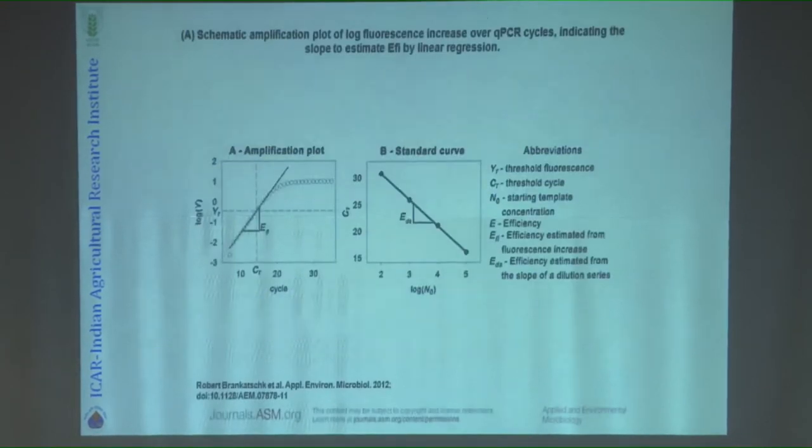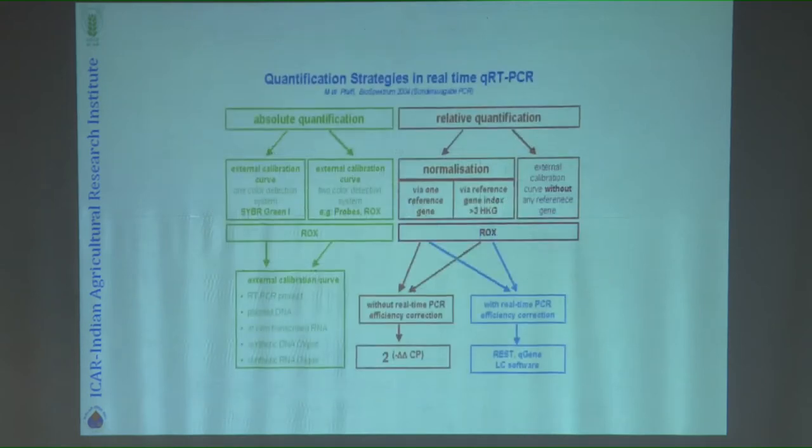These are the two, the amplification plot and the standard curve, which are used in this paper. This is very important because we need to understand this concept before we interpret our data. Data collection could be easier, but if you don't know how to use and interpret your data, your conclusions are going to be wrong. So it's better to know these aspects.